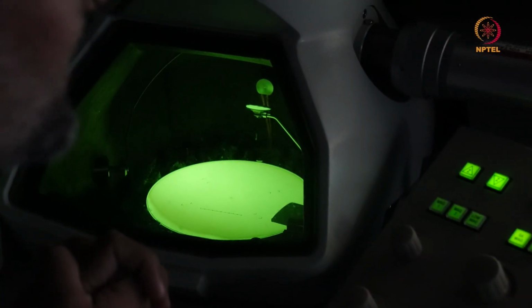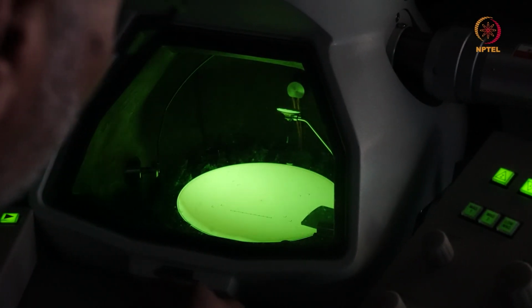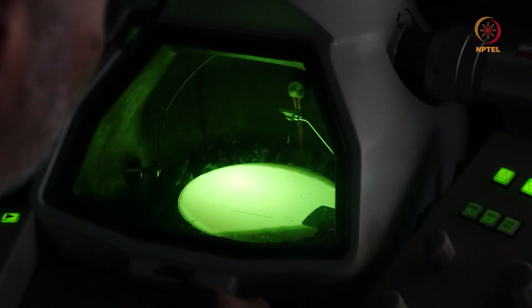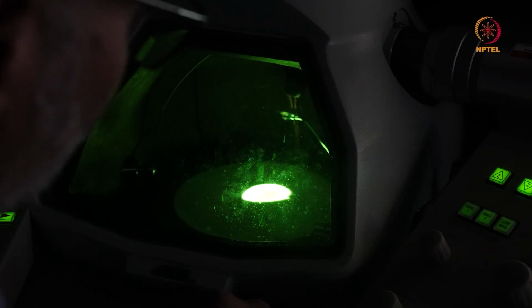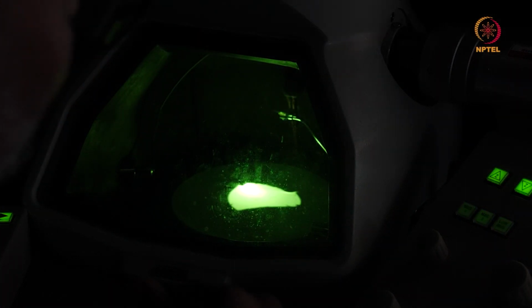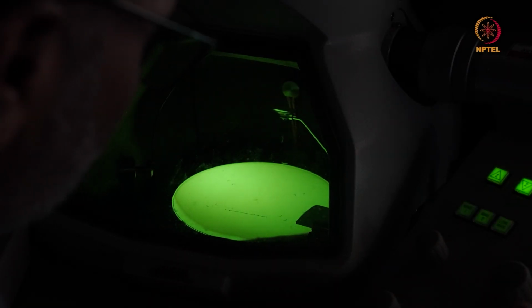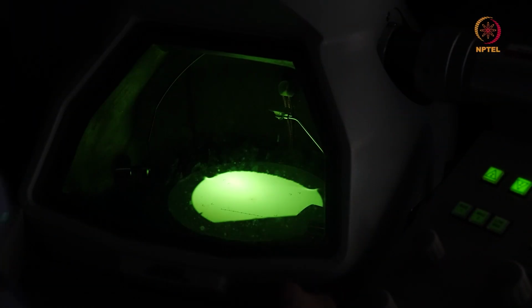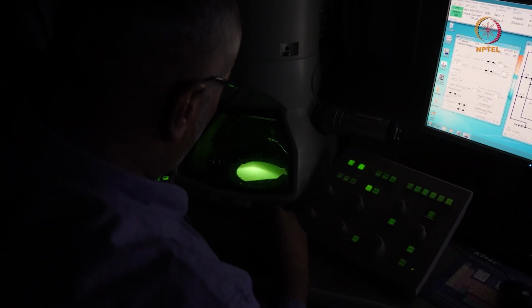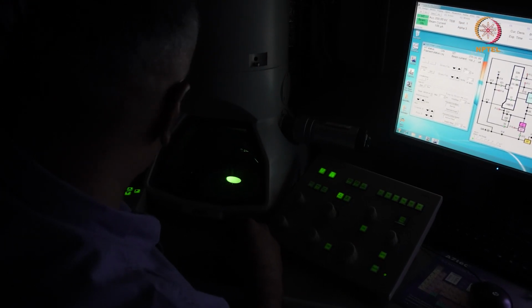Now the first step is improving the quality of the beam that I am focusing to a point. Why is this important? If I use this kind of a beam and I obtain any diffraction pattern, in fact, it doesn't affect significantly for high resolution imaging because I usually spread the beam and I look at a very small area. But by using an aperture, I can now improve this. So I'm now putting in the first condenser aperture, which is about 150 micron on this microscope.